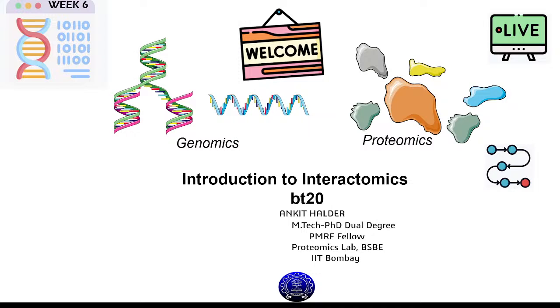In this week six, till now you have seen that we have gone through different protein microarrays. Now we have shifted to the reverse phase protein array, as shown in the lecture. We will be using different reverse phase protein arrays and then the label-free based techniques. One is the surface plasmon resonance.